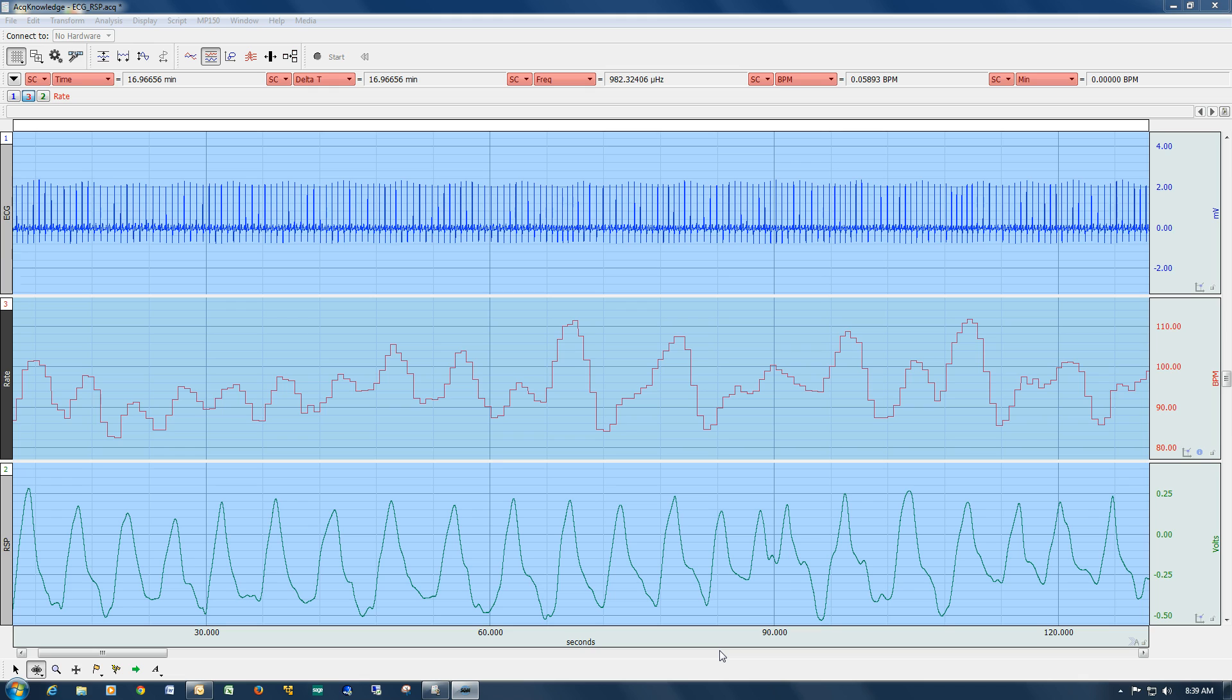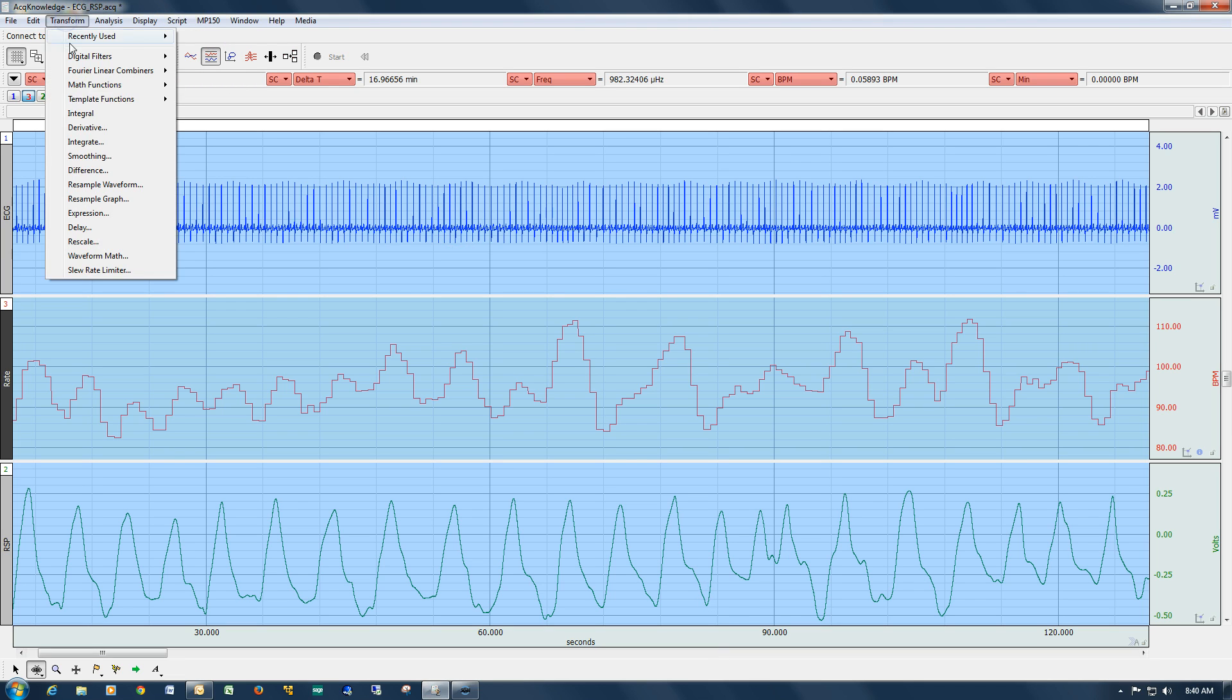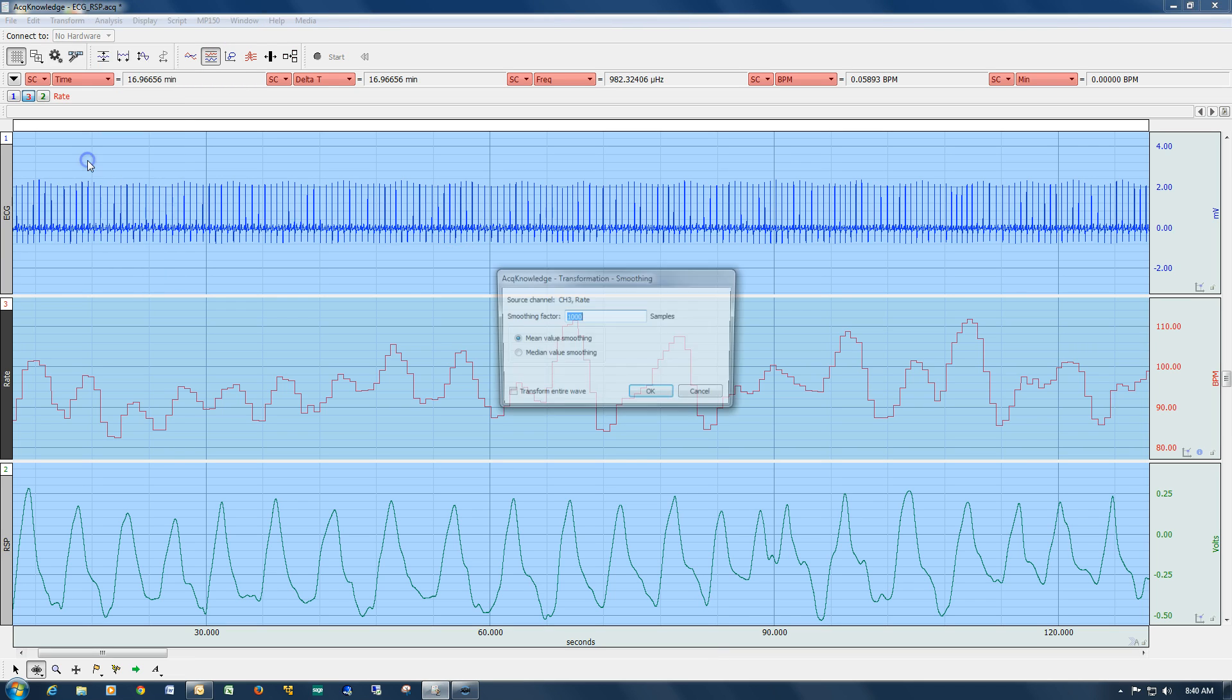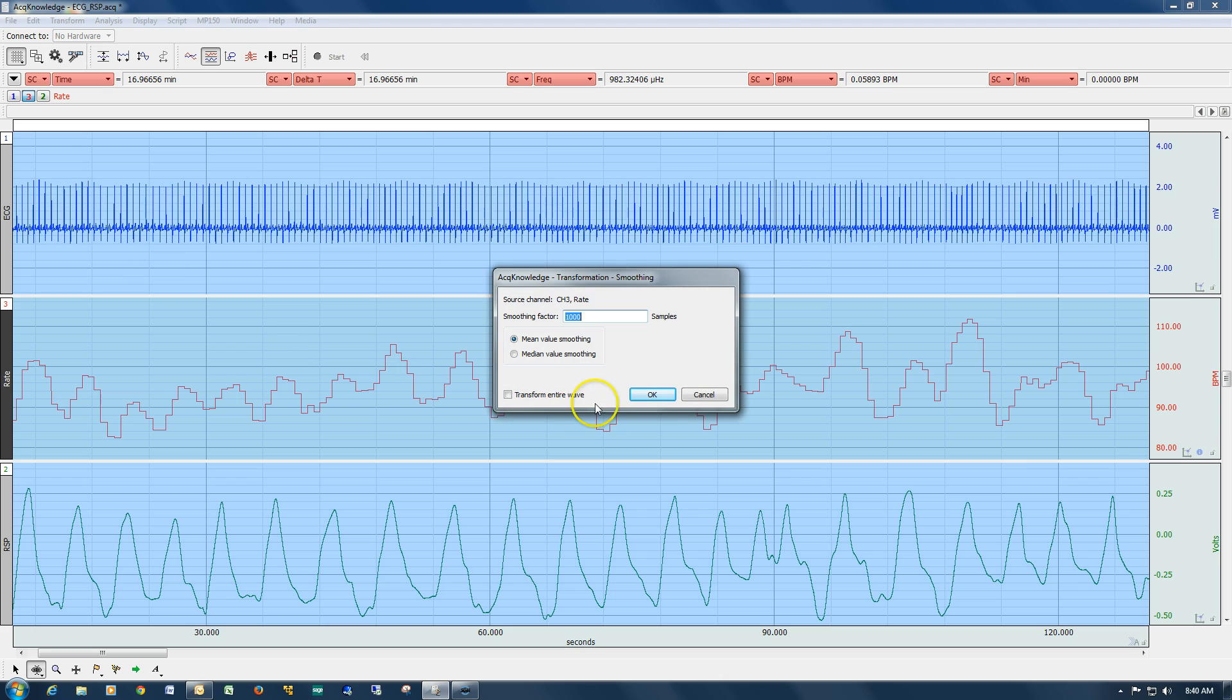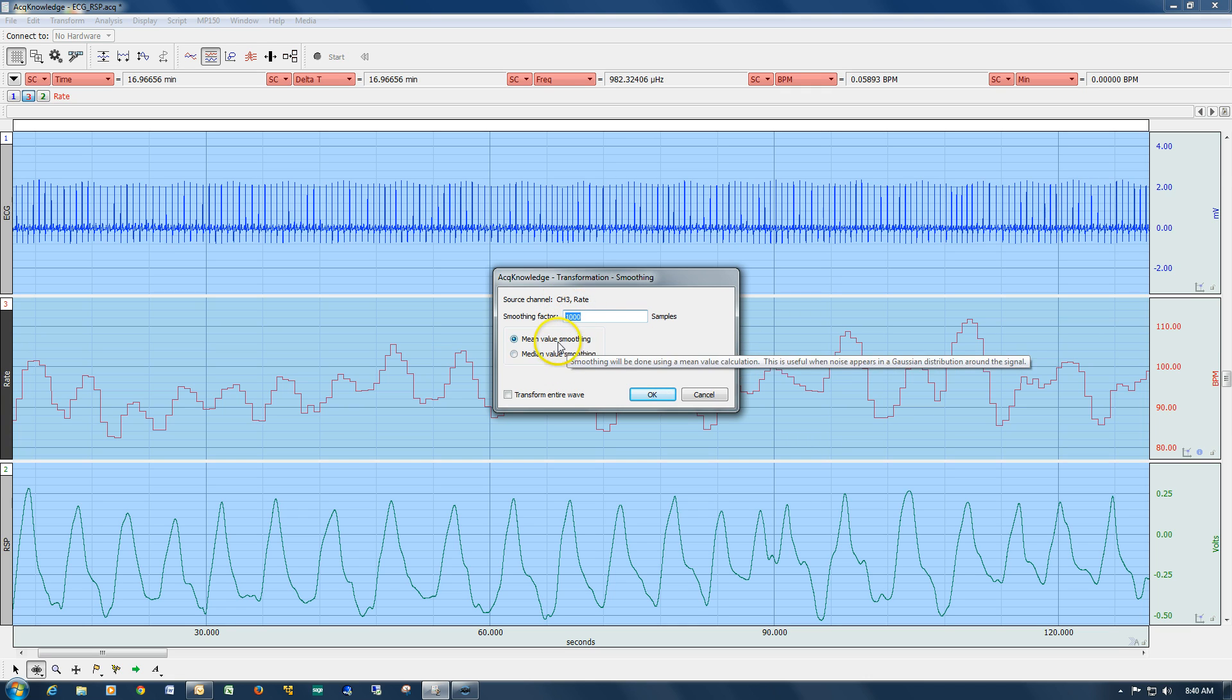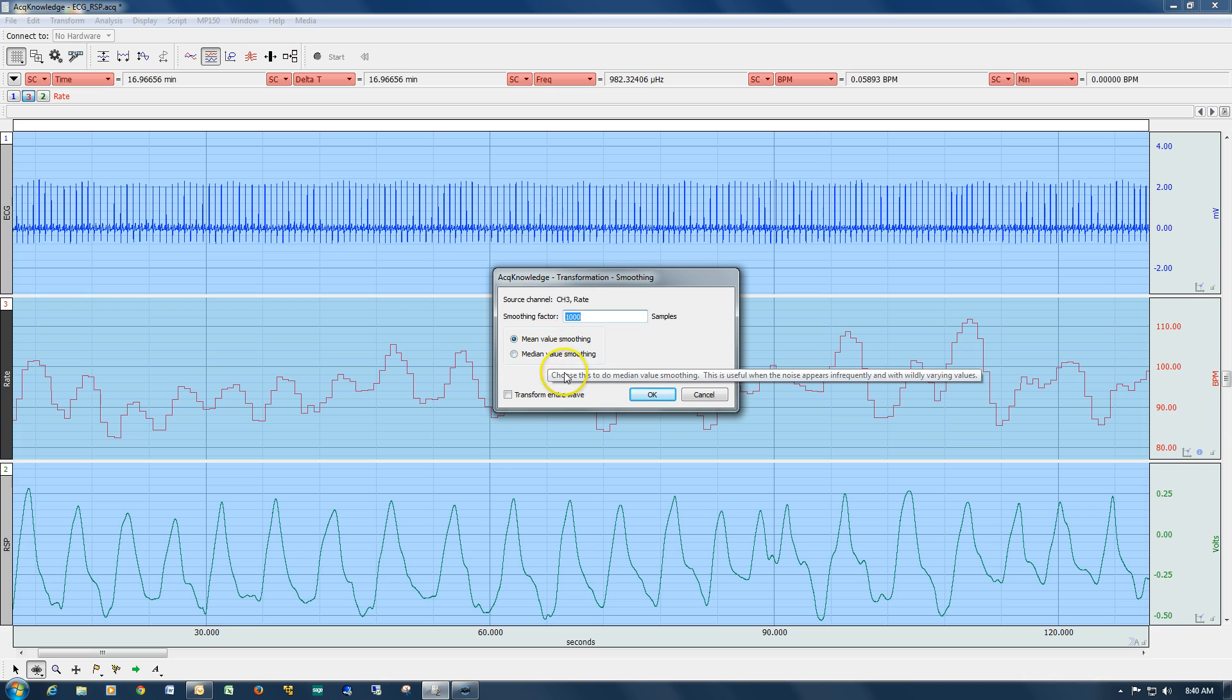There are two modes of operation for the smoothing, but they both work around the same principle. They're using a running average over a user-defined number of samples.